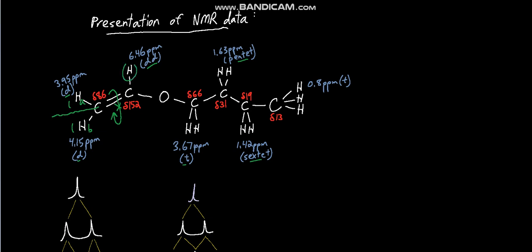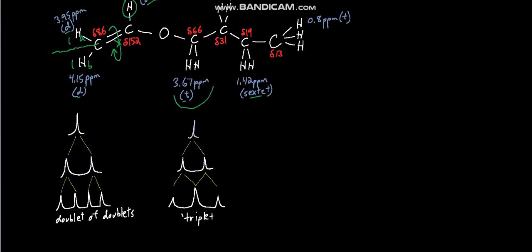And then here you have, therefore, this proton not being split twice by equivalent hydrogens, but split twice by non-equivalent hydrogens. So remember our triplet over here. That is a 2-hydrogen signal split equally by neighboring hydrogens that are equivalent. A split there, and then a split of equivalent magnitude there.